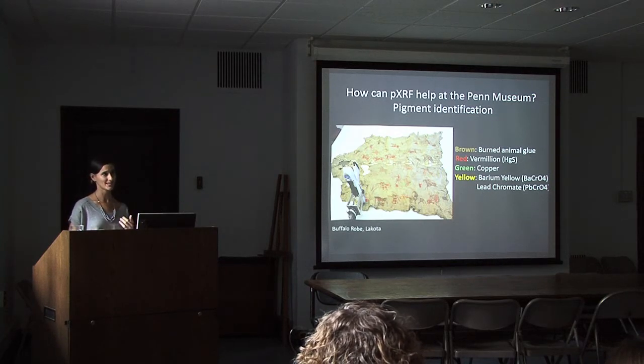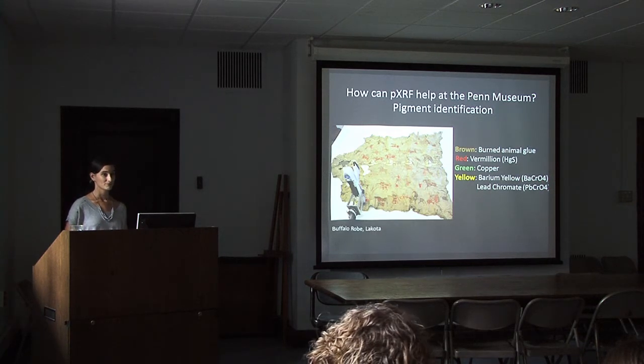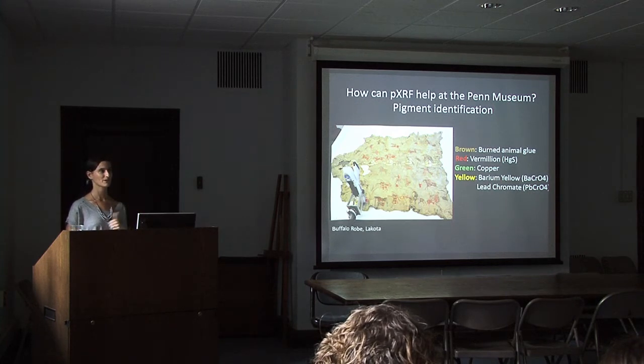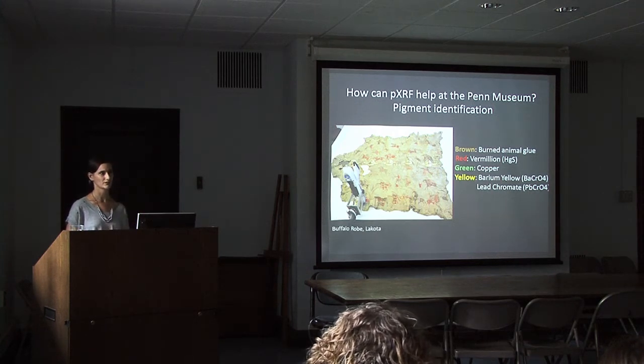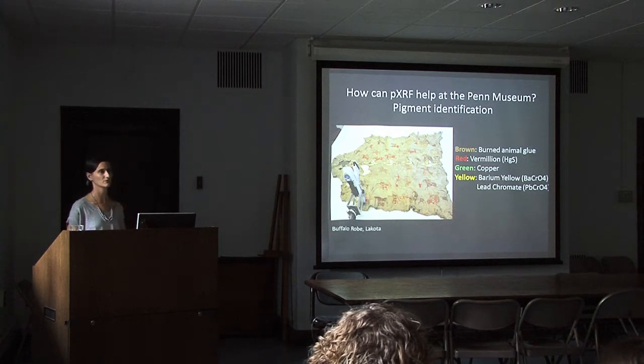So we know that the yellow contains barium, lead, and chrome. We've limited the number of possibilities of what it could be. And the question is, do we need to know more? Well, that depends on how specific you need to get. Here, barium yellow and chrome yellow were both used in the mid-19th century. That narrows down our field for when this robe would have been made. We know it was made some point after 1803, when these pigments first came into use.